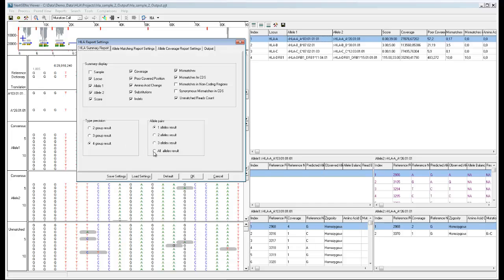You can also choose the number of allele pairs to report for each gene. In this example, the one allele result is shown, showing only the top allele pair match. You can change this to include additional allele pairs. The all allele pairs option will show the top four allele pairs, which is the maximum that can be included in the report.